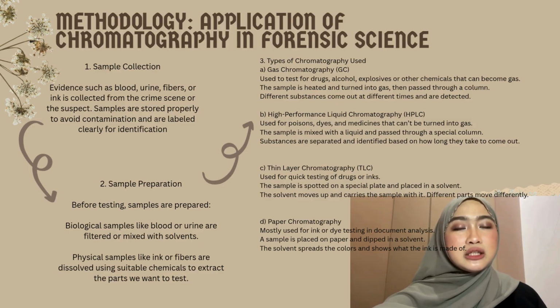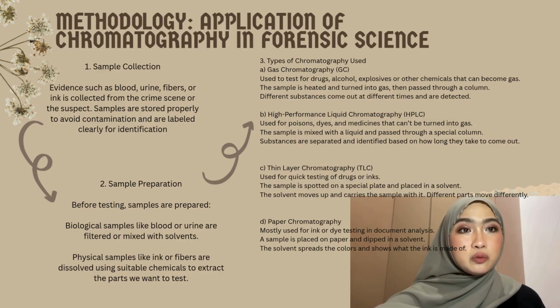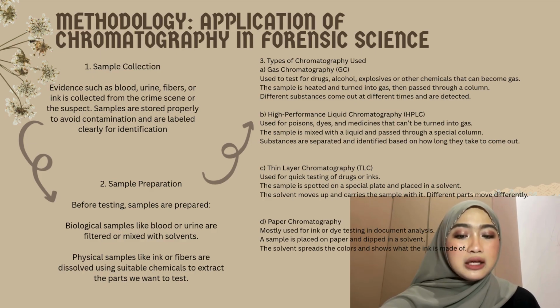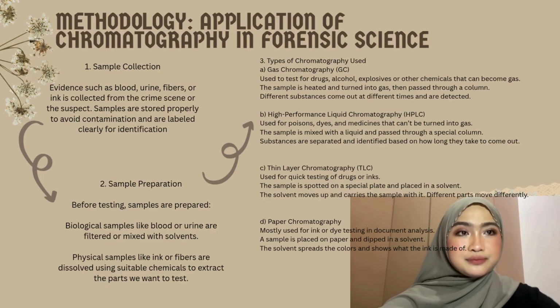For step 3, the types of chromatography we use. There are different types of chromatography used in forensics depending on the kind of substance we're testing. These include gas chromatography, HPLC or high performance liquid chromatography, thin layer chromatography, and paper chromatography.